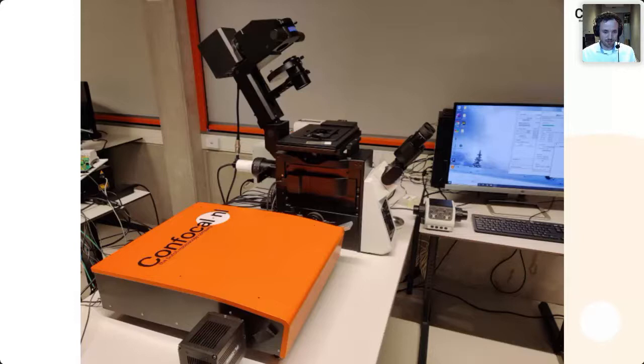And here we have the RCM2, what you have been coming for today, attached to the IX83 body. I will use two objective lenses: the 100x 1.5, also a very nice objective for very high resolution images, and the 40x 1.4, which has slightly lower NA but a much bigger field of view.